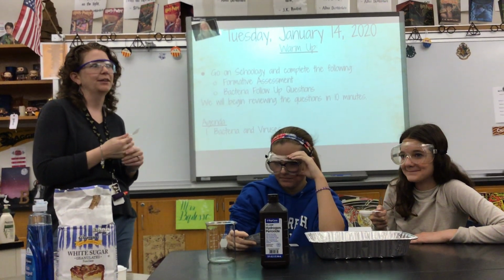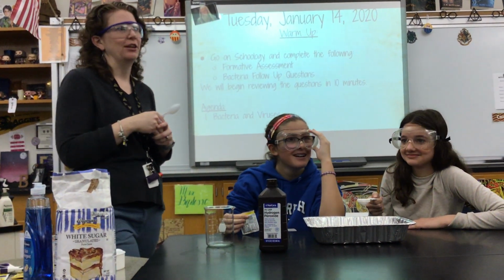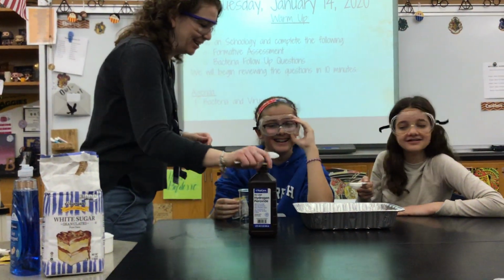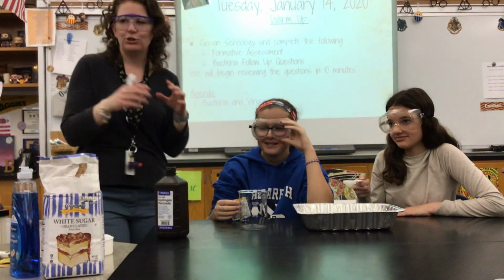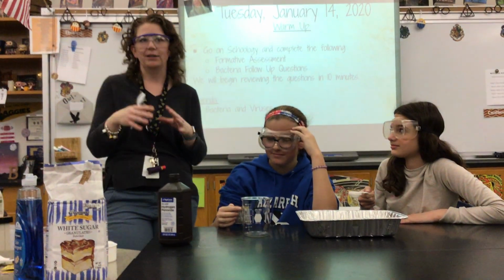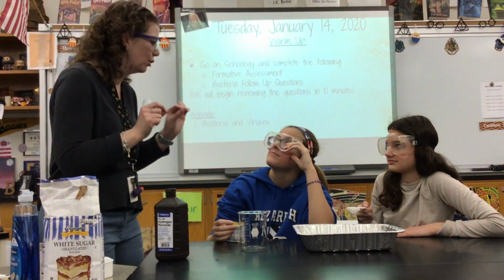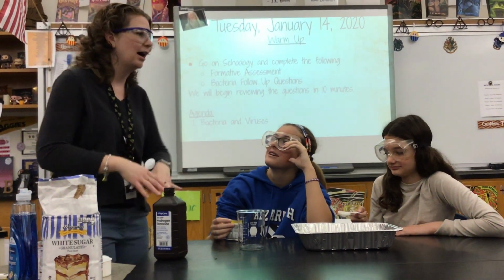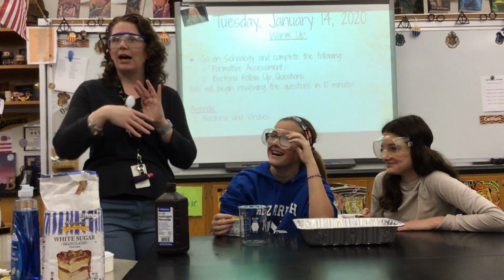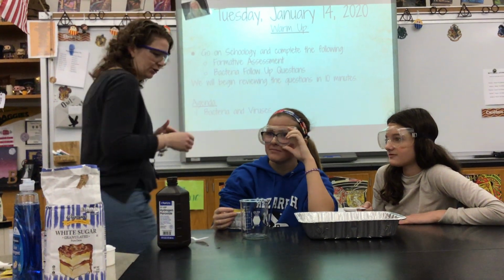What do we think, Gavin? A fun guy. It's a fungi, similar to Mr. Snyder. Okay, good. All right. So first thing that we have to do this reaction, and it's more commonly called elephant toothpaste, right? If you've ever seen elephant toothpaste. Now, I'm going to preface again with we're doing a very small version of this. Okay, this is not going to explode in your face, hopefully. We're not flooding my room, okay? If you want to see those YouTube videos, you can certainly look them up.